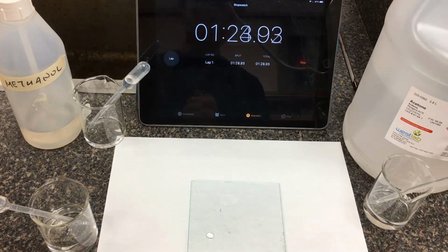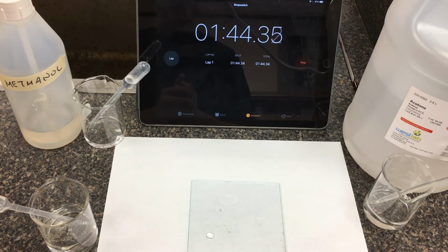So let's just wait on the other two here. We have our methanol solution. Although both the methanol and the acetone solution were a much larger puddle, a much larger pool to begin with, we can just qualitatively compare how long it's taking for these droplets to evaporate off.